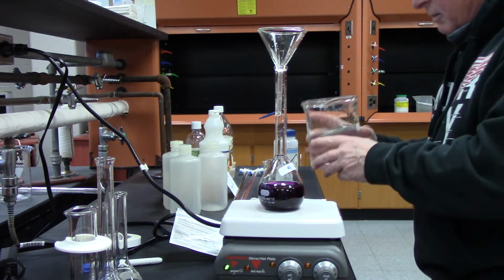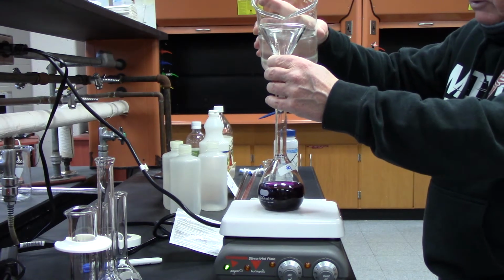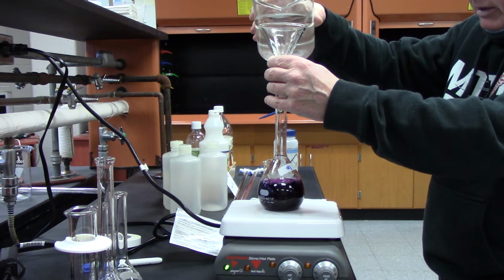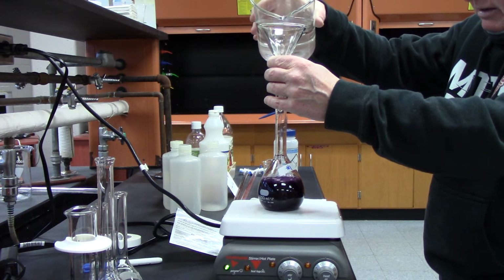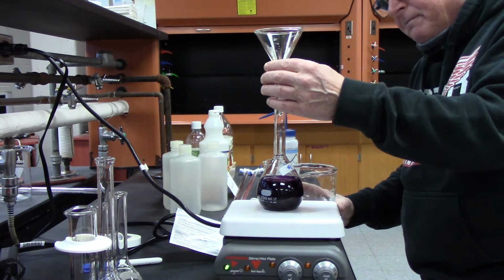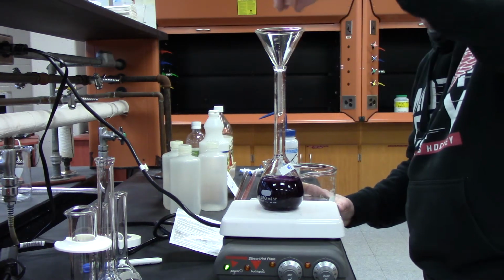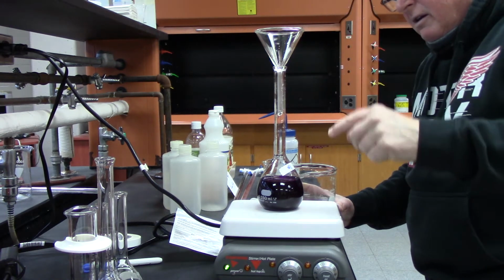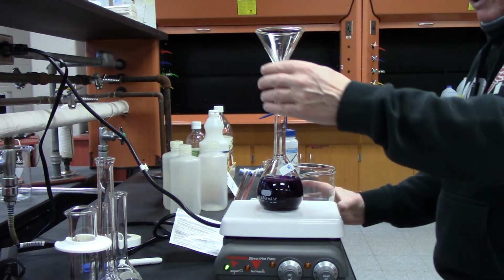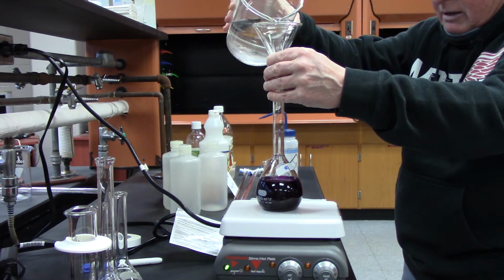So what I'm going to do now is take my stock water and add it to my solution. I'm going to add it slowly because this is where I messed up before. I'm going to add it slowly until it gets to the neck. What I did wrong last time is I left the funnel touching the neck. When it does that, as I add it, it's not going into the solution. And then when I picked it up, it went flying all over the place. So you want to have just enough air that allows water to move in there.